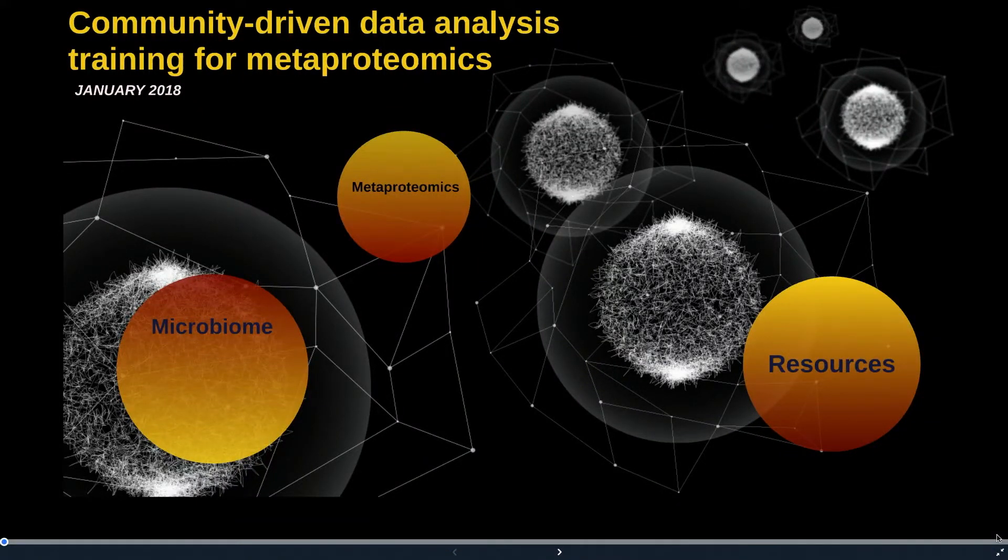Welcome to a video overview associated with the manuscript Disseminating Metaproteomic Informatics Capabilities and Knowledge Using the Galaxy P Framework. Here we provide a general summary of the Metaproteomics Gateway resource, which facilitates metaproteomic analysis.